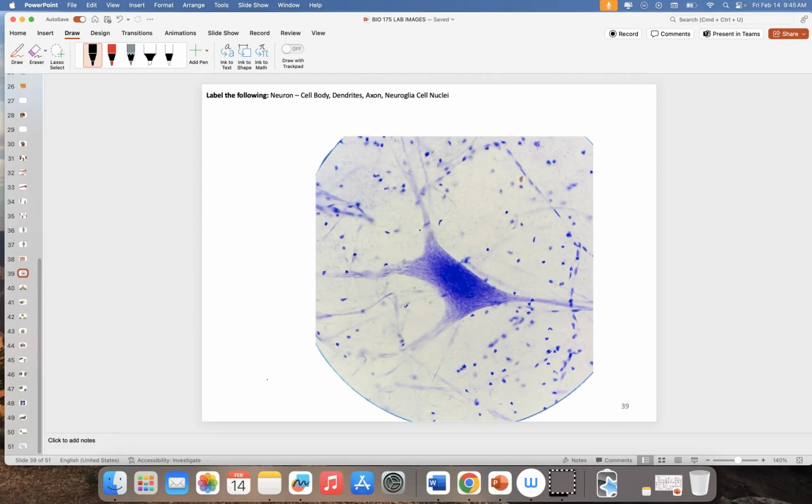Hi folks, and welcome to A&P with Dr. O. In today's video, we are going to take a look at neural tissue, and we're going to look at it more closely underneath the microscope, and we are going to look at the neuron, parts of the neuron, and also the neuroglia cells.